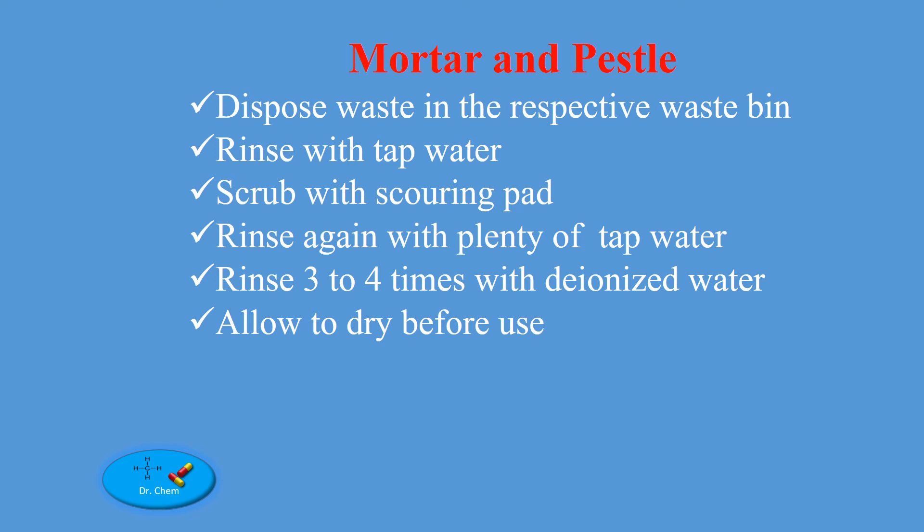For mortar and pestle: dispose waste in the respective waste bin. Rinse with tap water. Scrub with a scouring pad. Rinse again with plenty of tap water. Rinse three to four times with deionized water. Allow to dry before use.